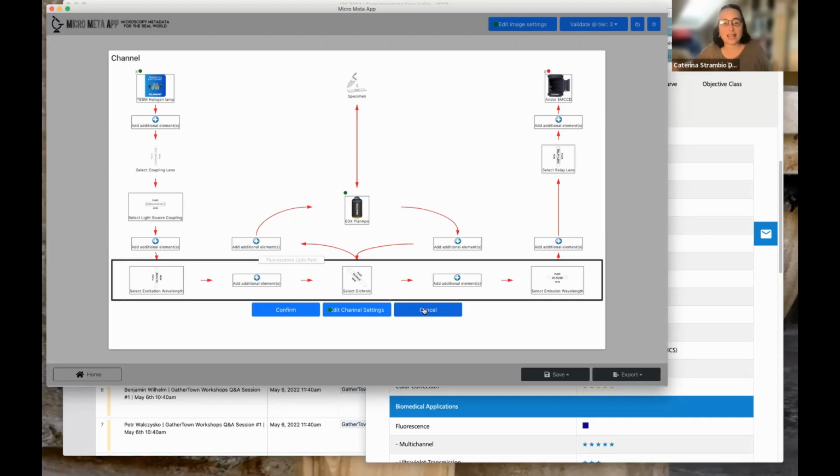For example, everybody has to write the methods sections for the paper eventually. So if we can do a little bit of work here, minimize what they have to do, the big carrot is that once you have to write the paper, a lot of it is going to be done for you. So that's the idea, but obviously it's a big work in progress.